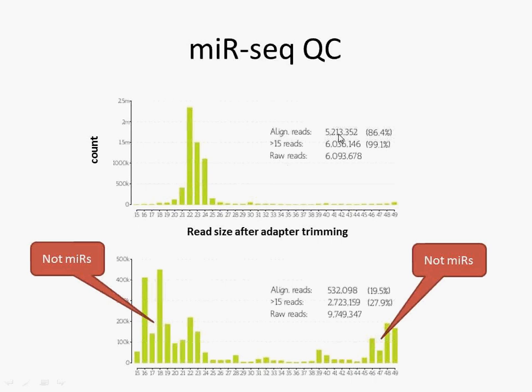how many of them actually align to mirBase precursors, and we expect high numbers here depending on how good the size of the library was. To do a contrasting example, this sample, generating even more reads, has much fewer reads that are above 15, so that means we had a lot of reads that were very small, and they're basically too short to be aligned to anything.